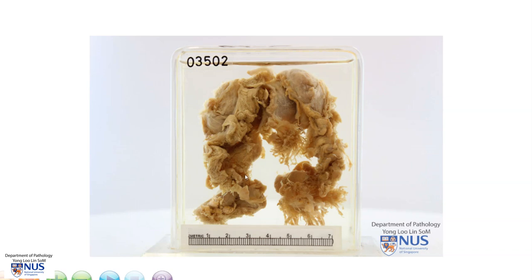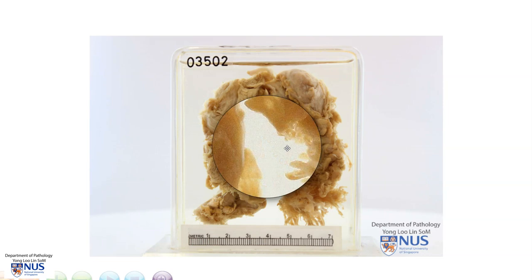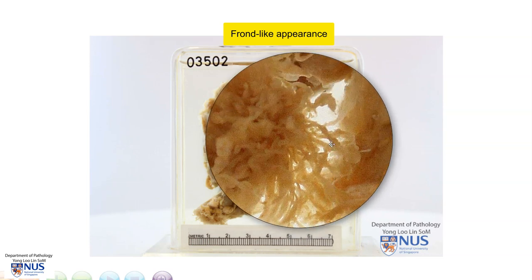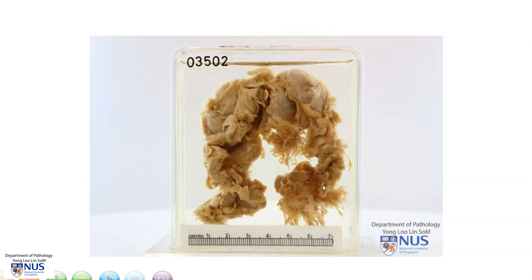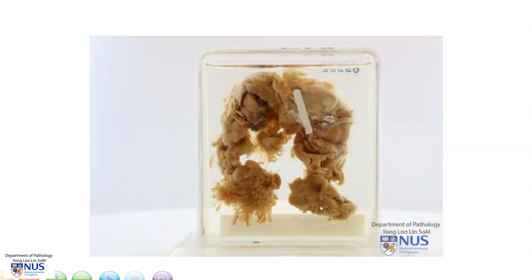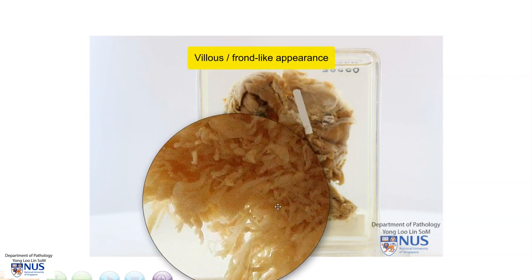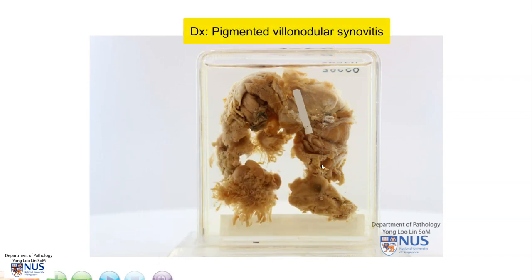This is a gross pathology specimen taken from the synovial tissue in the knee joint. This is a very large piece of synovial tissue with a very interesting appearance. If you look in this area, which I'm going to magnify, we can see that there is almost this frond-like appearance or these finger-like projections, giving it a papillary appearance grossly. We can also see quite obviously this appearance on the opposite surface. So it has a somewhat villous or frond-like appearance, and the diagnosis here is pigmented villonodular synovitis.